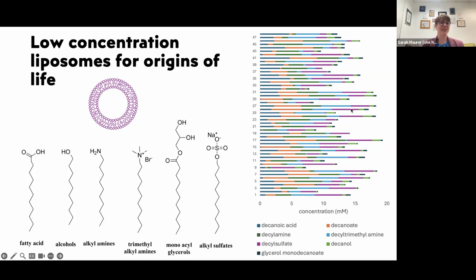So which dipeptides you would add, there's not an easy physical chemistry principle underlying which peptides are good and which peptides are bad. And so the problem is there are too many possible inputs for that. Yeah, but I think adding organic mixtures is definitely in our future, some type of organic mixture.